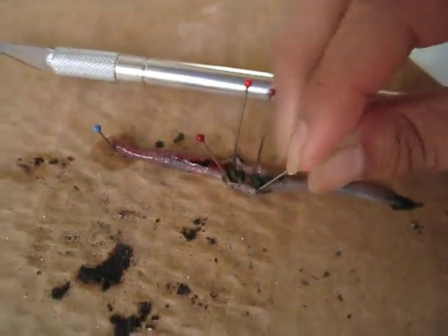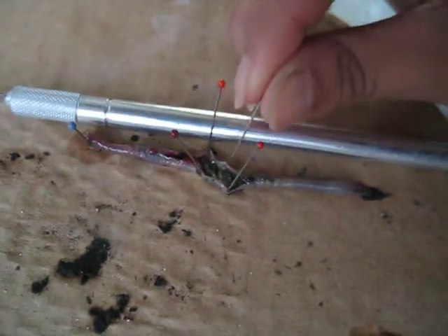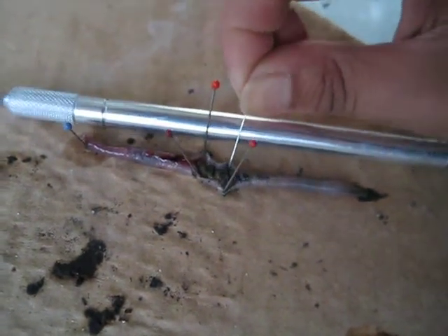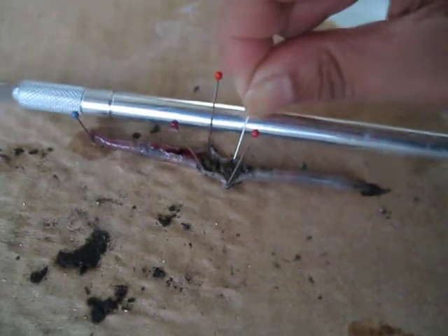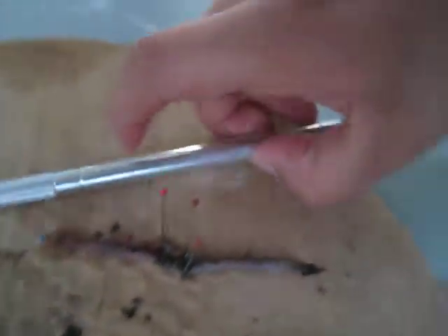This is our attempt at dissecting an earthworm. The needle let go. We popped open the thing right there, as you can tell. The heart — because it's bleeding. And the intestine. Right there, it's bleeding.